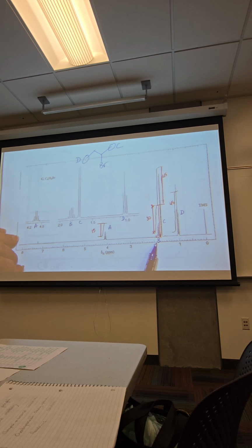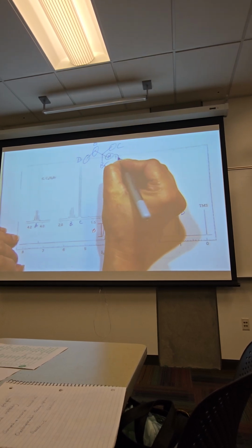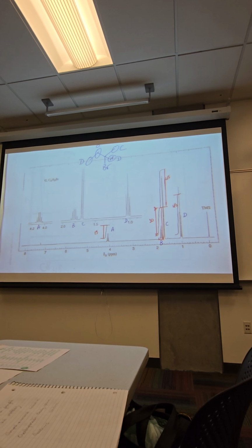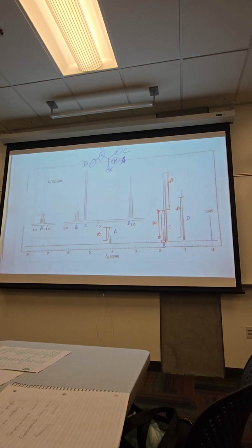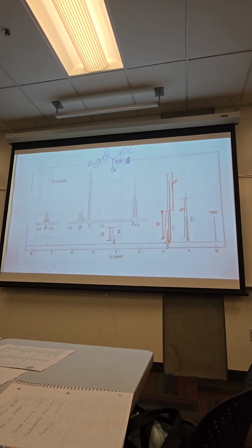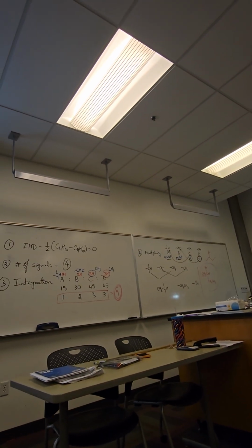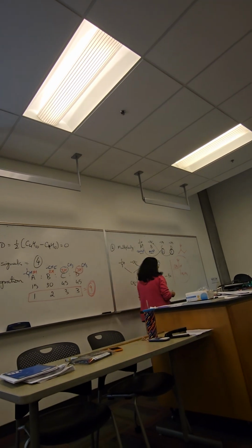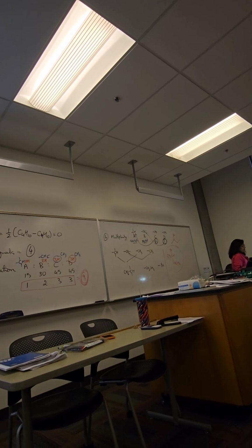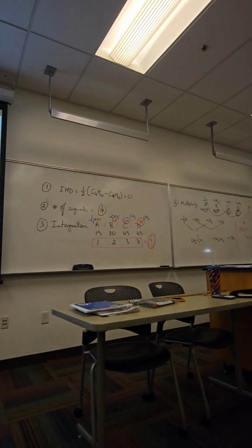Which one is B? Integrating for two hydrogens. And this is D. So big A, sorry, thank you. So what we are doing is we are telling the reader exactly which signal corresponds to which hydrogen in the structure you came up with. That's called assigning the signals. Make sense, everyone? Questions on this one? Everybody understands the integration part? Okay, let's look at another one.